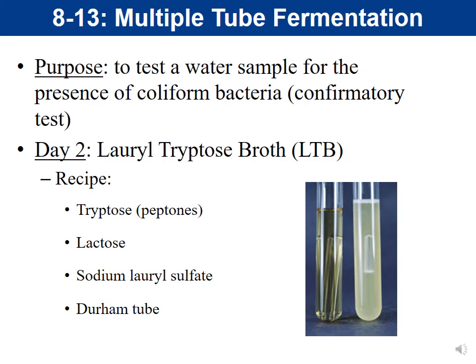So now back to our multiple tube fermentation. Again, the purpose of our multiple tube fermentation is to test a water sample for the presence of coliform bacteria. This whole test, so all the tubes, would be confirmatory. The first test that we set up as part of our multiple tube fermentation was the LTB broth. And again, the LTB stands for lauryl tryptose broth.